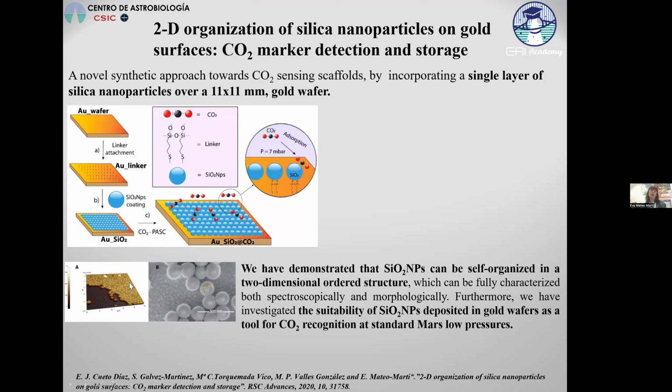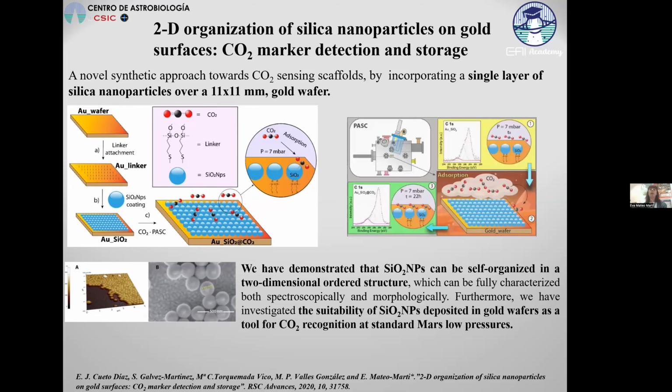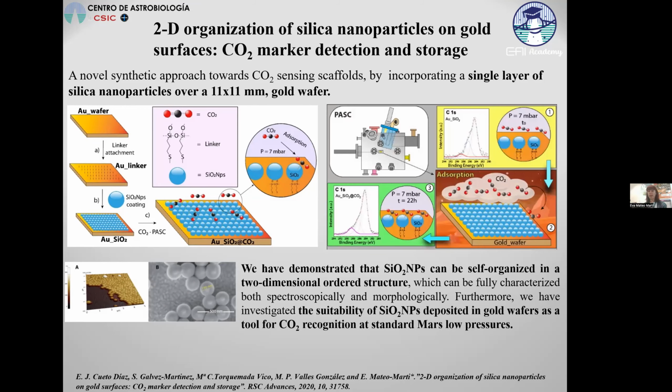Here we can see the same image with scanning electron microscopy and also AFM, atomic force microscopy. We were doing those microscopy and spectroscopy in order to characterize those slides with the nanoparticles. And then we introduced the gold sample with the nanoparticles inside of the PASC, inside of the simulation chamber, and we set up the Mars atmosphere.